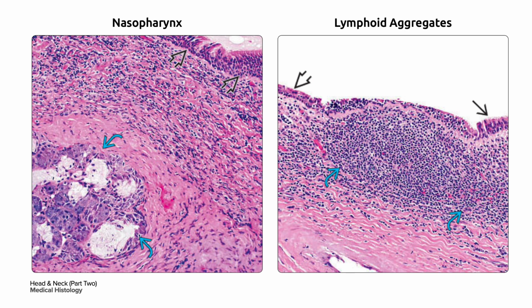On your right, scattered submucosal non-tonsillar lymphoid aggregates in a curved blue arrow are present throughout your nasopharynx. The overlying mucosa consists of a stratified squamous epithelium in bold black arrow alternating with the respiratory type epithelium in single black arrow.